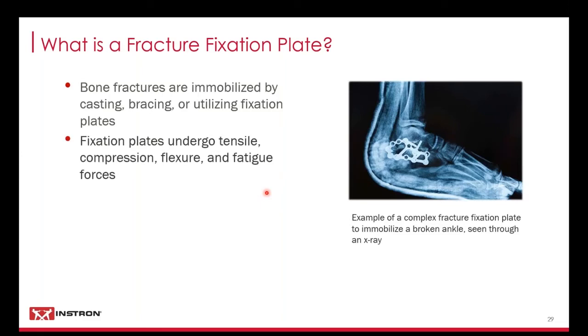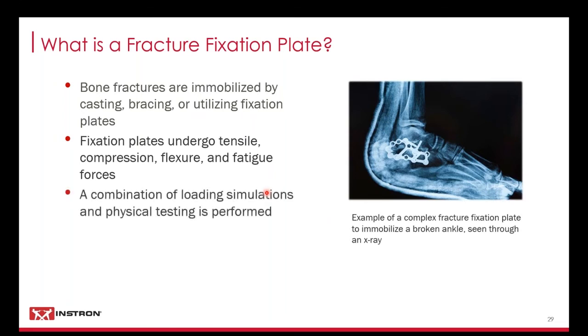So there's several different forces acting on these as well, though. So there's tension, compression, flexure, and certainly fatigue. So every step that this person would take could be applying different forces to it. So it's really hard to run one simulation or to be able to run tensile tests and determine if it's designed well or not. So it's a combination of loading simulations and physical testing that is performed.